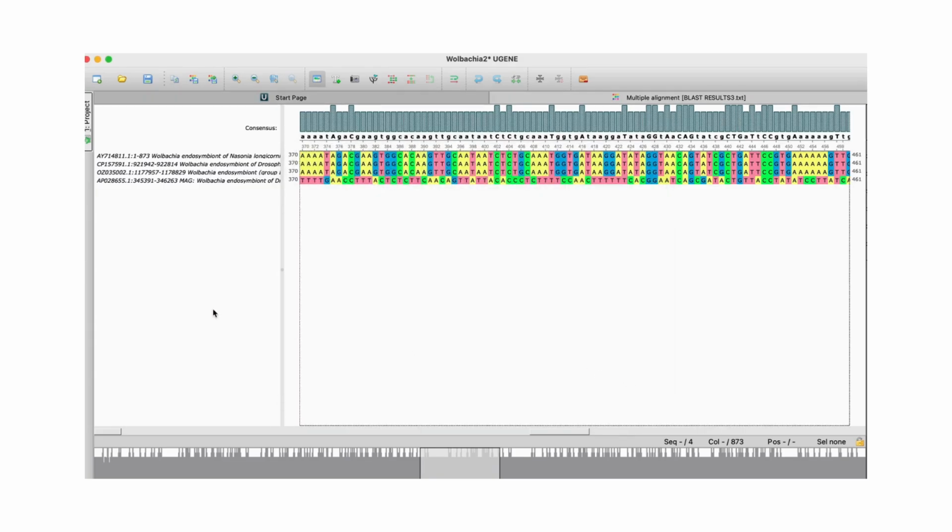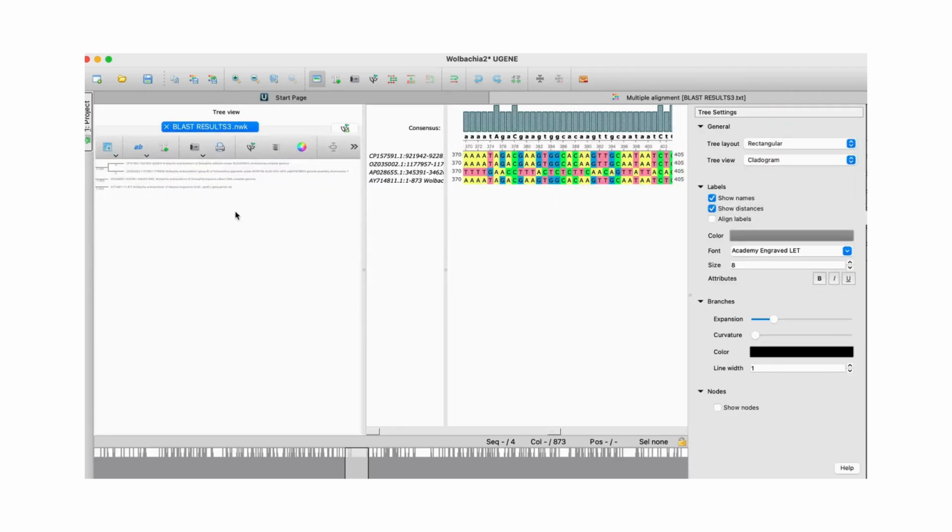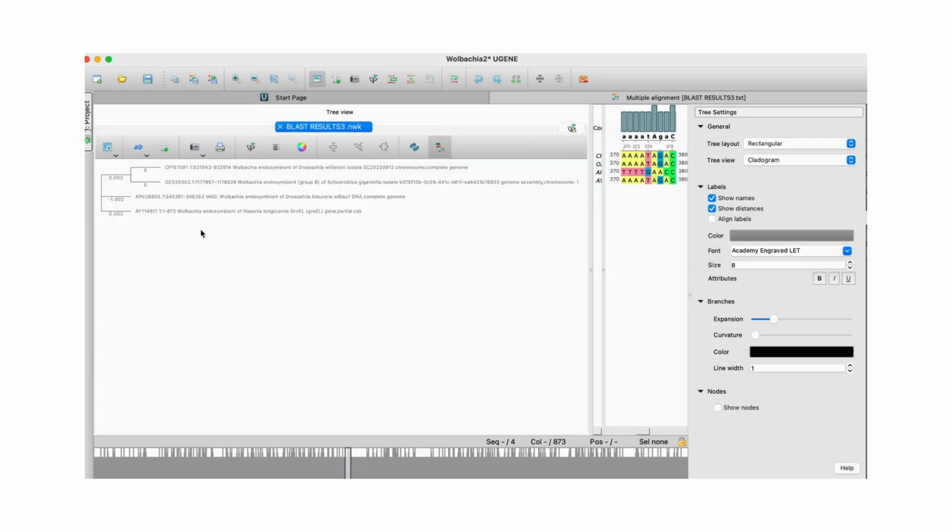And when you do, it will generate a tree for you, so you can visually see and also look at the distances. So here's the tree. Let's see if we can get it a bit bigger. I'll try to move this over. Here's the tree. So remember the tree from the other one? This one has got the distances as well. At least you can see the distance between the two sequences. Here there's 0, meaning there's no distance between these two. They're basically very much the same as each other, whereas you have these other ones with the distances there.